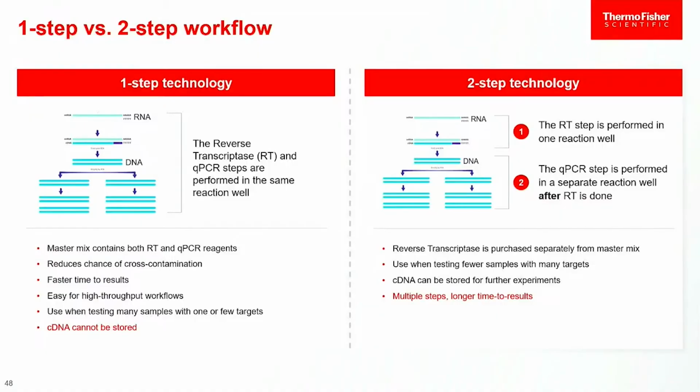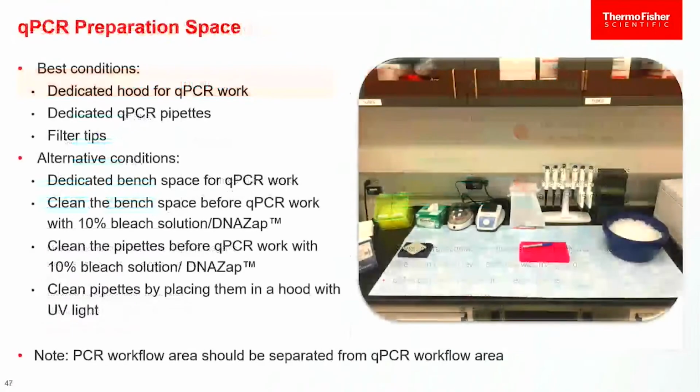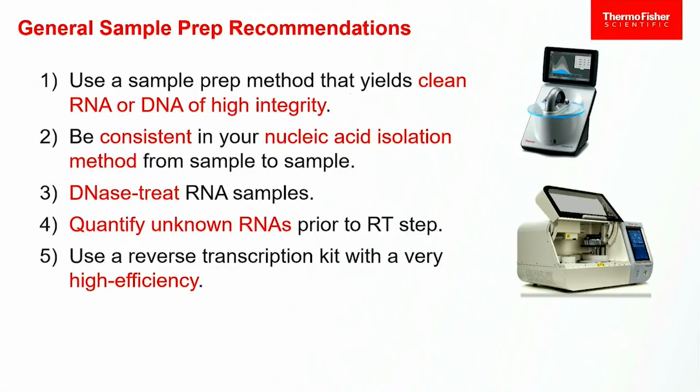That's going to be high quality. What I was talking about on the last slide was mostly making sure that you had good material that goes into the reaction. So once you're past that first hurdle of the reaction, you're pretty much good to go.